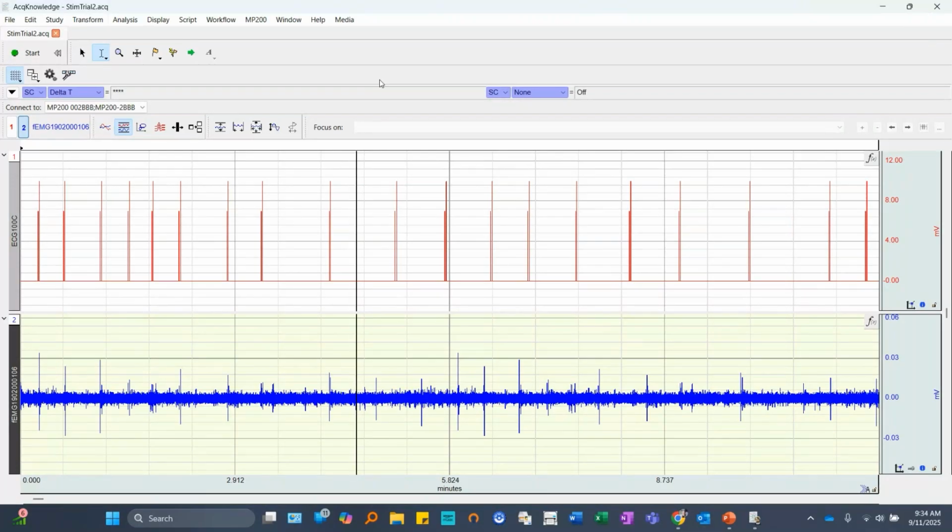And with any automation, of course, you can only take that so far. There's always the point to where you're going to have to put eyes on the data to make sure that what you do set up, whether you're doing it by hand or whether you've automated certain things, is performing correctly and marking things that you want to mark correctly, extracting the measures that you want correctly, and so on and so forth. So you can never, at least in my estimation, just blindly create automation and trust it innately. To me, you've always got to put eyes on the data to make sure that things are being properly done.